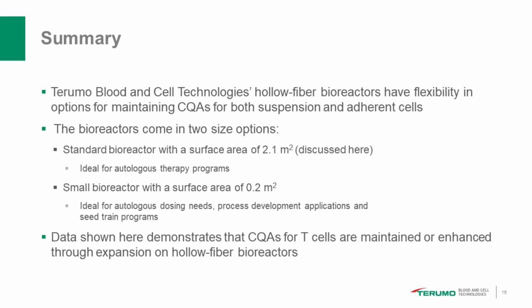For suspension cells, it's quite simple. We just circulate around the loop and then tell the computer to open a valve, and that puts the cells into a harvest bag. And then it's very quick downstream, it takes about 60 seconds.